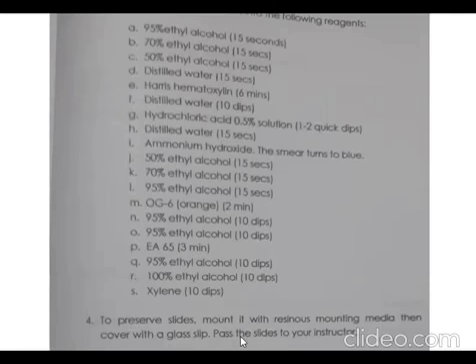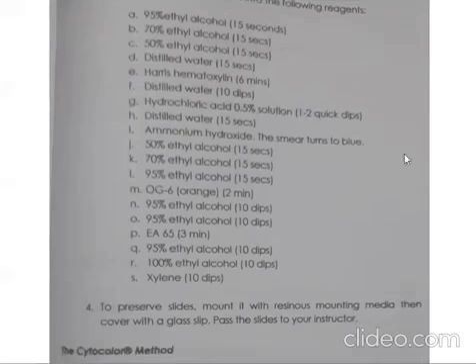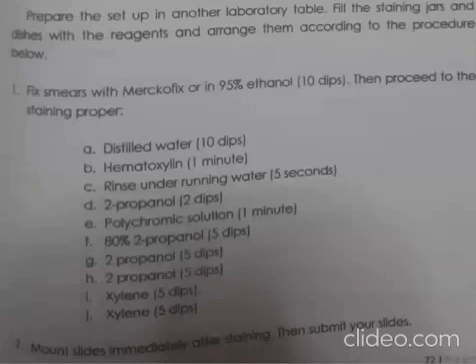Now let's proceed with the cytocolor method. Okay, so for the cytocolor method, it's quite shorter in terms of time and in terms of the number of steps. Kaya po, di ba, sabi ko kanina, sa cytocolor method, ang kanyang staining time lang is 3 minutes.